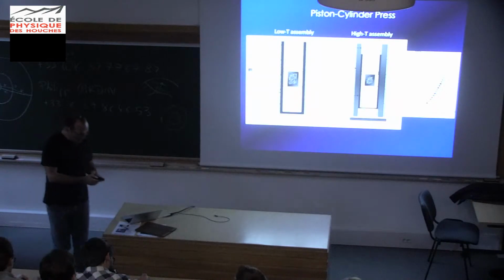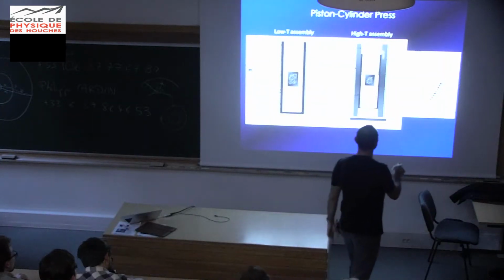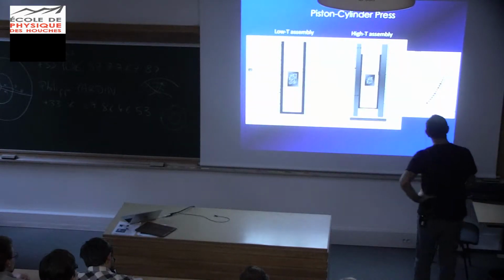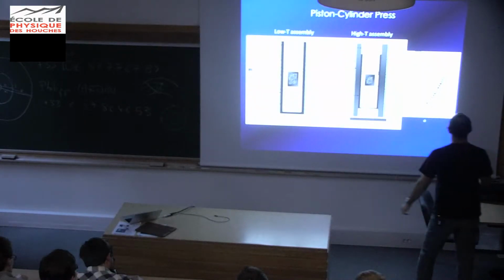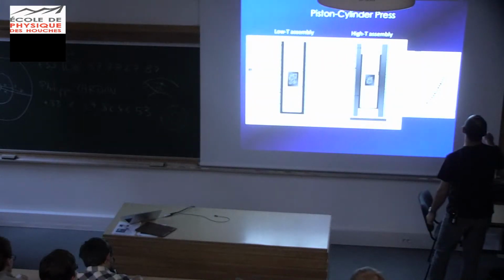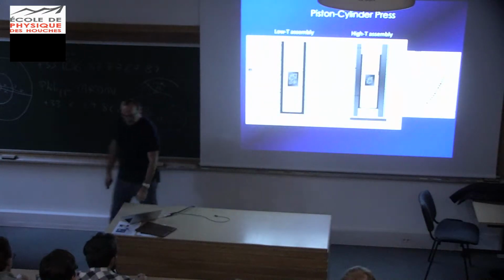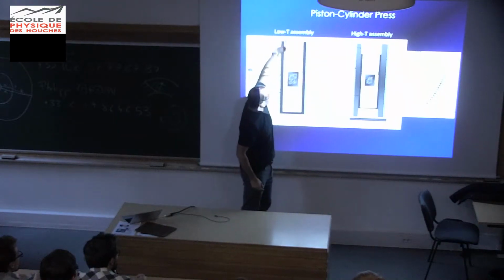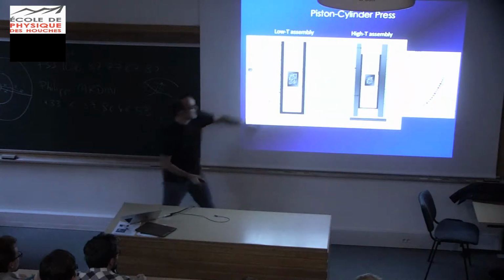Okay, so here you have a typical example with a lanthanum chromite insulator, sorry. You'll understand in the next slide why I said heater, because lanthanum chromite is also used as a heater for the multi-anvil. And basically at 30% of operating current, you're already at 2400 C. And temperature is measured, so this is a hole in which you send a thermocouple, and temperature is measured basically here.